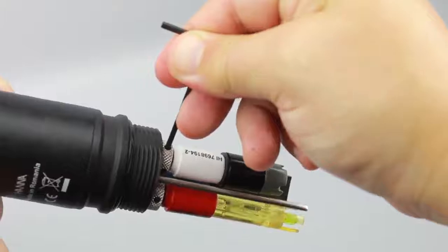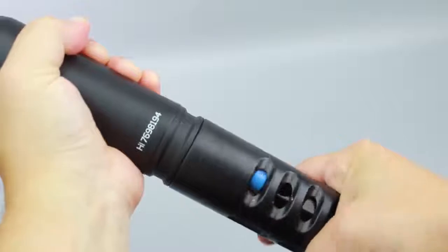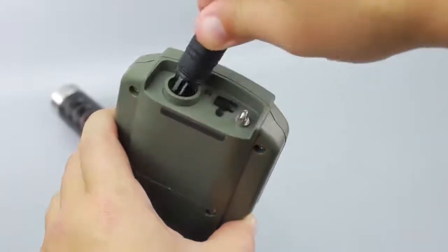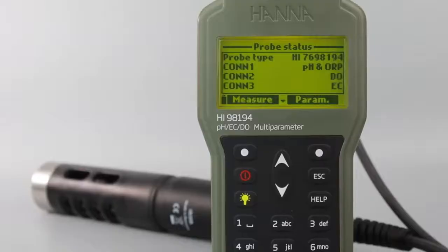Once complete, screw the protective shield onto the probe body. This will help protect the sensors. With the meter off, connect the probe to the input on the top of the meter. Turning the meter on, it will automatically recognize the probe and the installed sensors and identify them on the probe status screen.